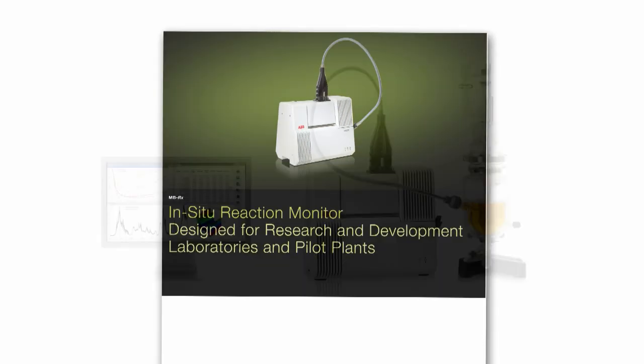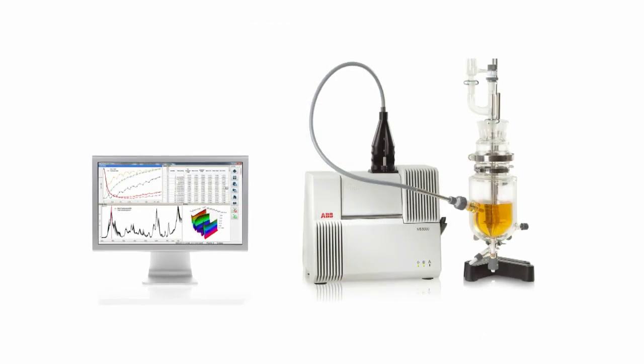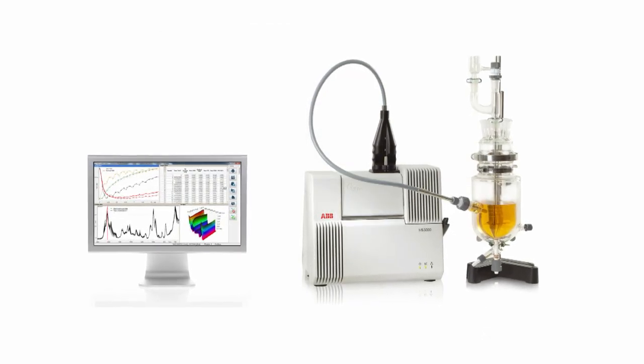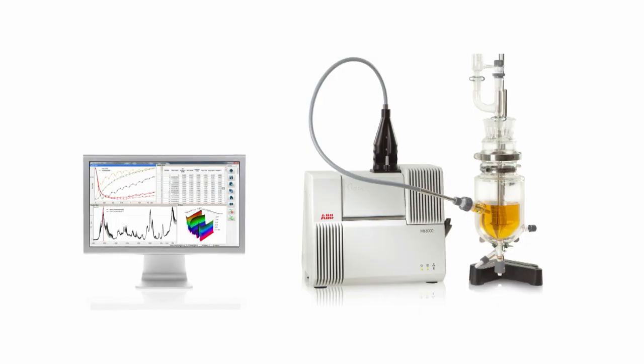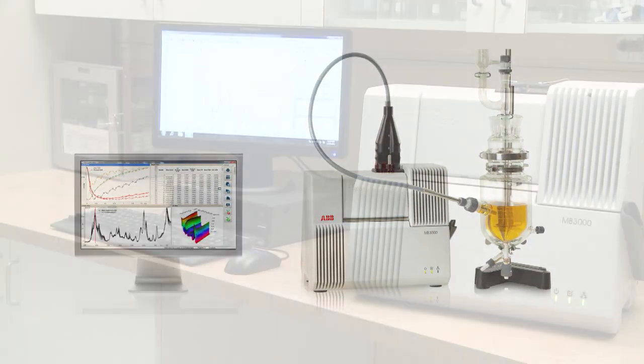Intended for laboratories and pilot plants, the MBRX provides chemists with direct access to real-time experiment data.